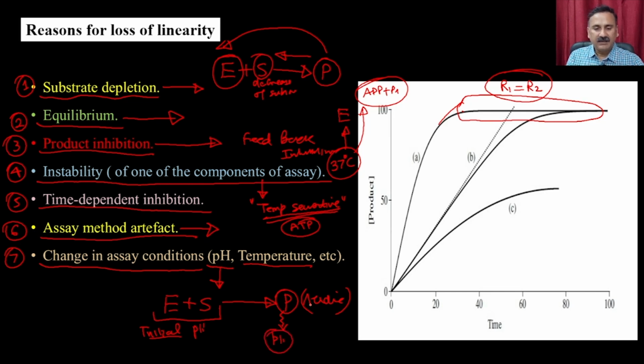In other cases, sometimes you have assays that are endothermic, right? So when the product is forming, it also affects the temperature. Although the majority of these assays are done in incubators or in a water bath, so you always maintain a regular temperature, the pH can always be modulated.